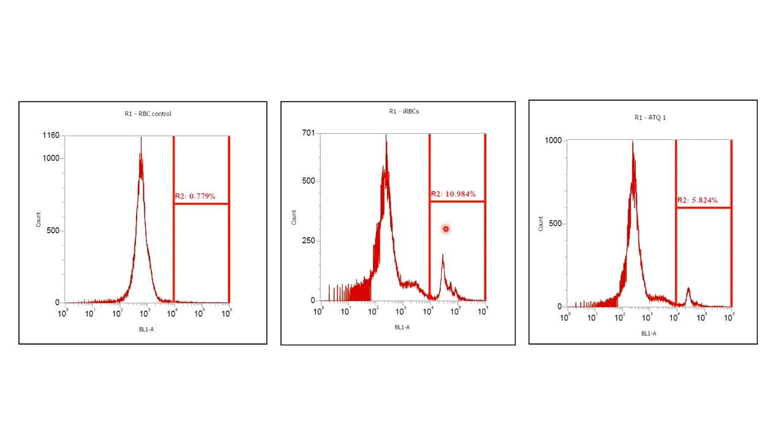But actually by flow cytometry you can analyze whether the plasmodium is dying in its natural habitat or not. And what is the natural habitat of plasmodium? The RBCs. So what we do? We take the RBCs, we infect the RBCs with plasmodium, and we put a DNA binding dye. What will happen? RBCs don't have a nucleus, so they don't give fluorescence for the DNA binding dye. But if RBCs are infected with plasmodium, they will give the fluorescent signal, because the plasmodium present in the RBC has DNA and it gives the signal.